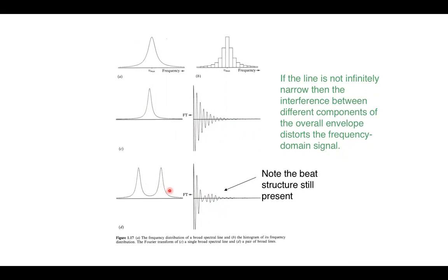So we can have what seems to be very well resolved peaks, but actually the waveform is still pretty complex.